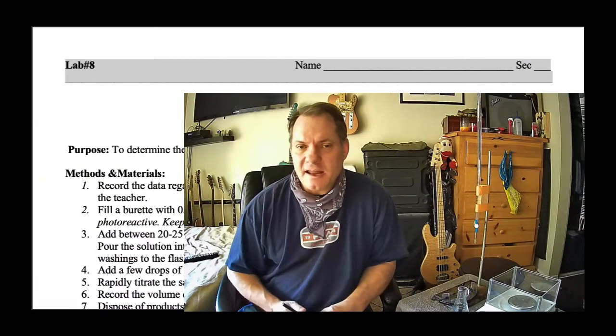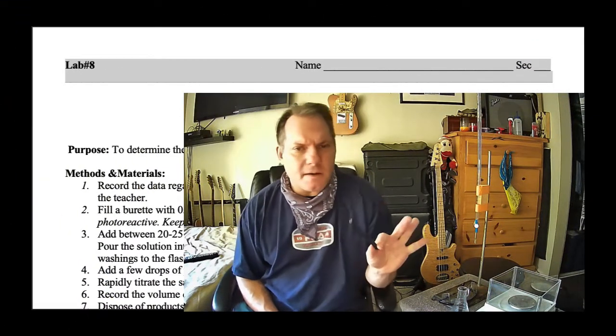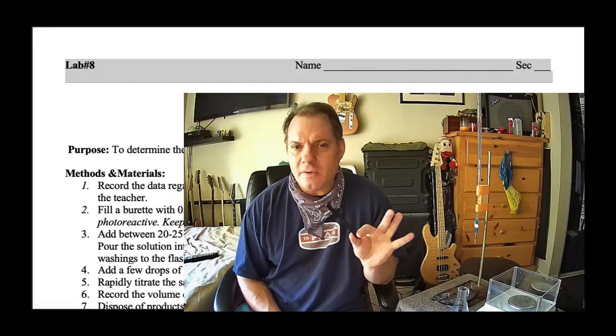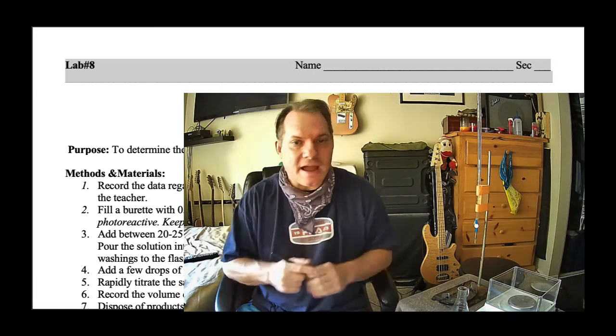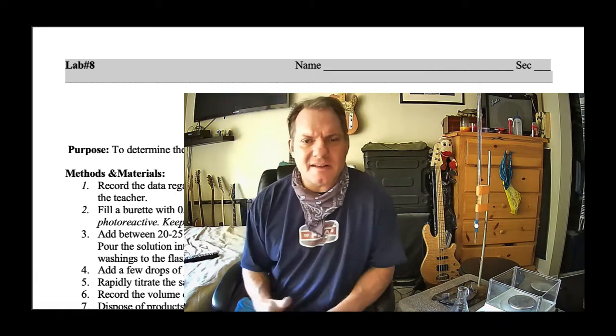Alright kiddies, today we're going to do an experiment where we determine the identity of an unknown cation via a titration in a reaction that you're actually familiar with. Let's go ahead and get started.